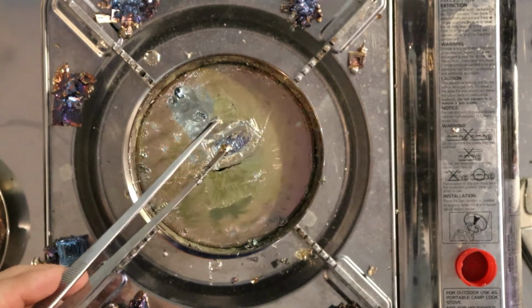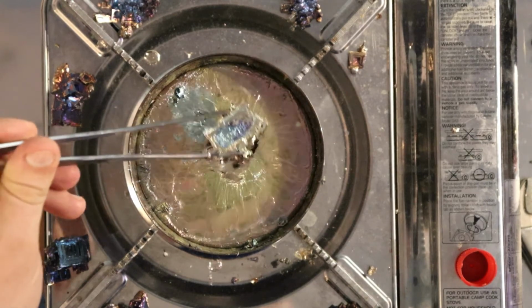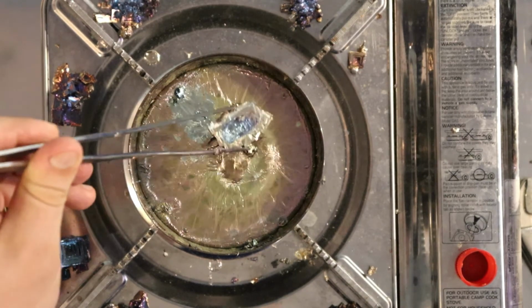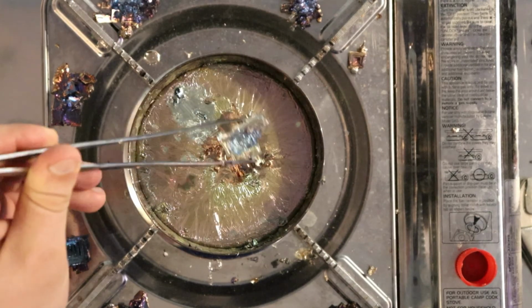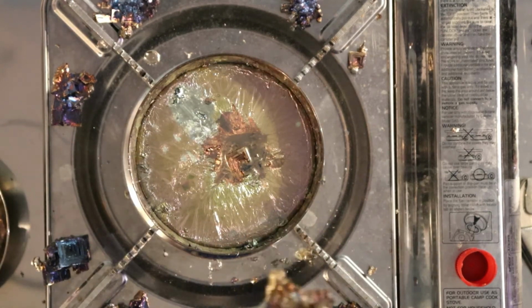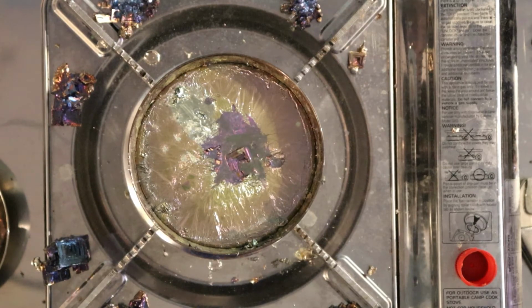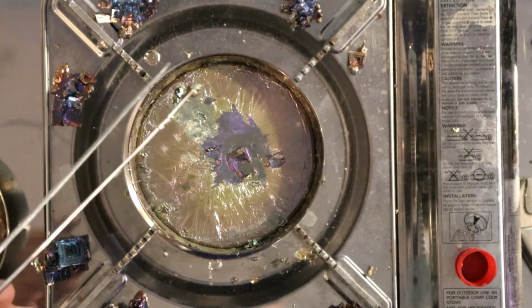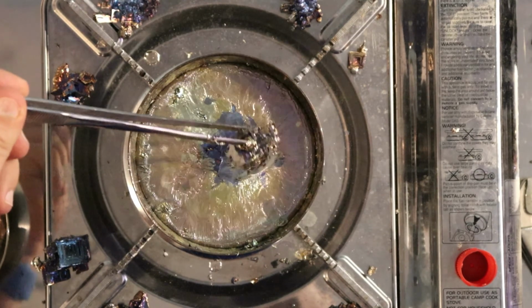Oh, hey, this is actually doing something, and it feels like it might be close to, oh, it's pretty big, whatever it is. Oh, and it's falling apart as I shake it. So, mixed success. Here's the base. I'm going to set that down so I can rescue the crystals that I just knocked off. As happened with some of these other experiments tonight, further research needed.